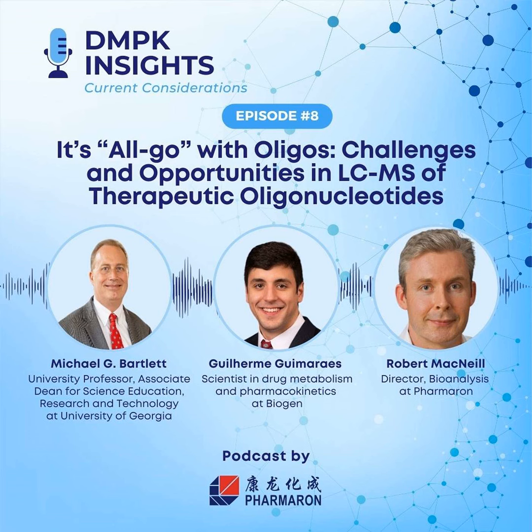So a couple things to keep in mind for those methods as well. And certainly liquid extraction for oligos has been around since the dawn of time. And so, there's going to be a lot of people that have used that chloroform phenol extraction for 70 years with oligos. And so, you got to recognize that there are people who have had a lot of experience with it and a lot of success with it, and they're not going to walk away from it very quickly.